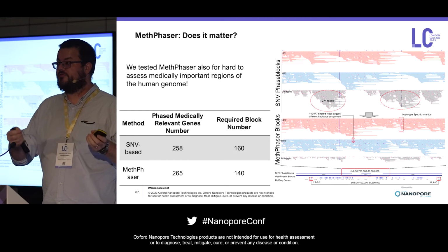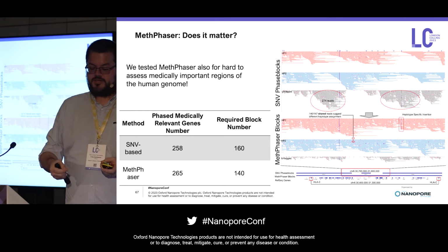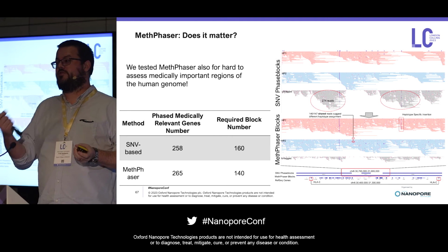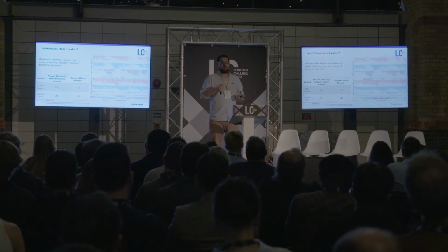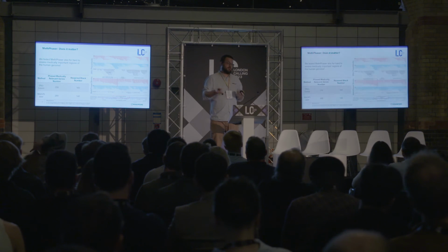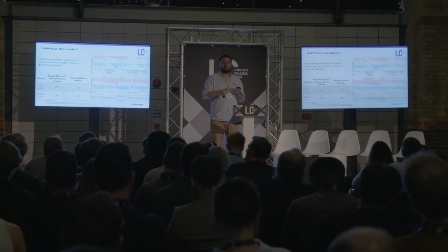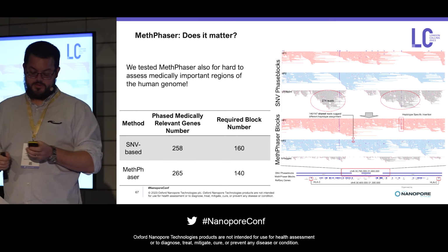And the third cool thing, which we didn't systematically benchmark, is that with this we were also able to assign haplotypes to structural variants while doing this phasing on the SNPs. And this is really something cool, because everyone that looked into phasing of structural variants probably has seen that WhatsHap and other tools make a lot of errors in assigning haplotypes across SV regions.